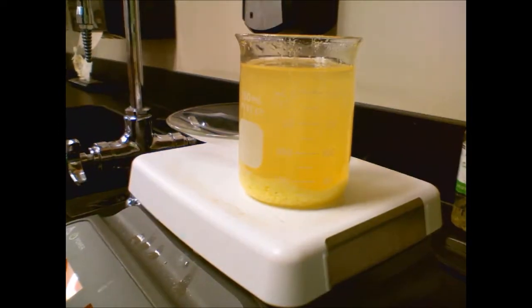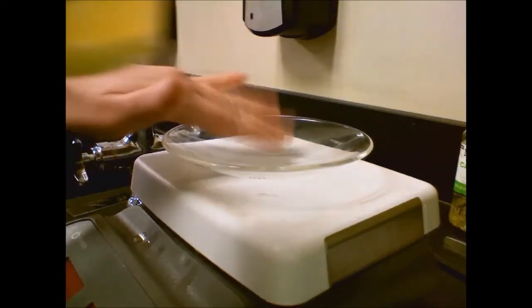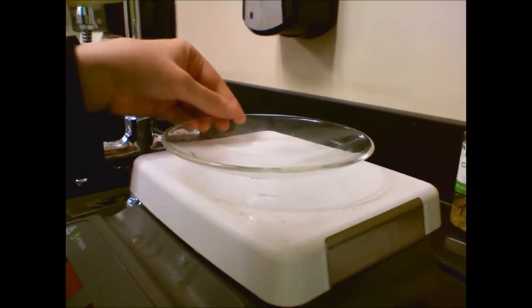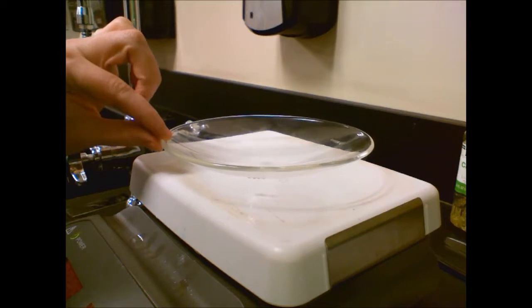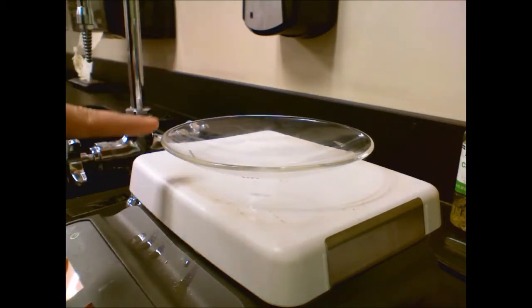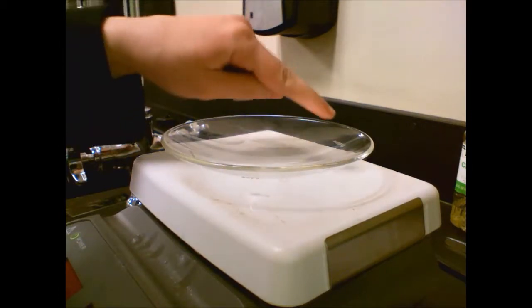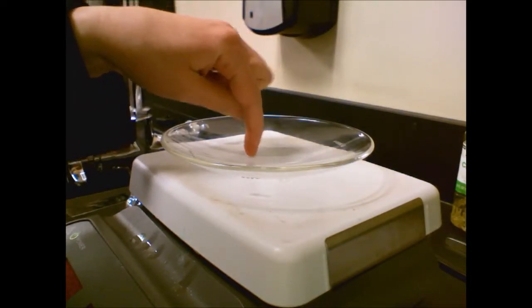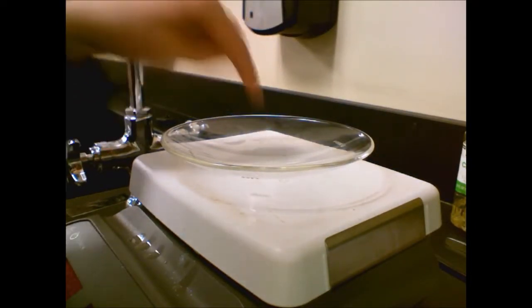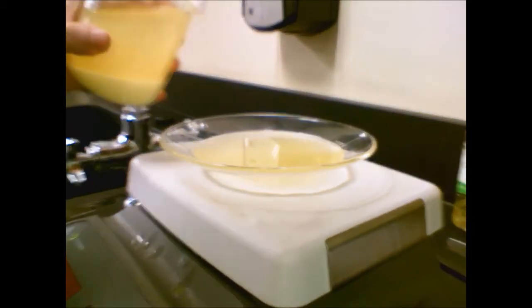There you go. I'm going to now pour my departiculated solution into this now warm watch glass. Out near the tips, it is very much barely warm. When I overheated this in past experiments, I would get large orthorhombic crystals around the edge, and I'd end up with monoclinic because the sulfur would actually melt in the middle. So right now I have this at 80 degrees. I just realized I am right in your way, so sorry.